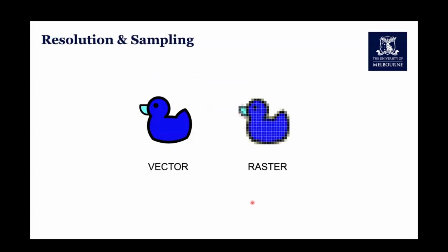One other thing we need to look at when we're acquiring the data is the sampling. If you remember, I mentioned that your pixel has a relative dimension that corresponds to the sample that you've imaged. What we're doing when we're taking a digital image is creating what's called a raster image. Essentially, what we've captured is divided up into pixels.